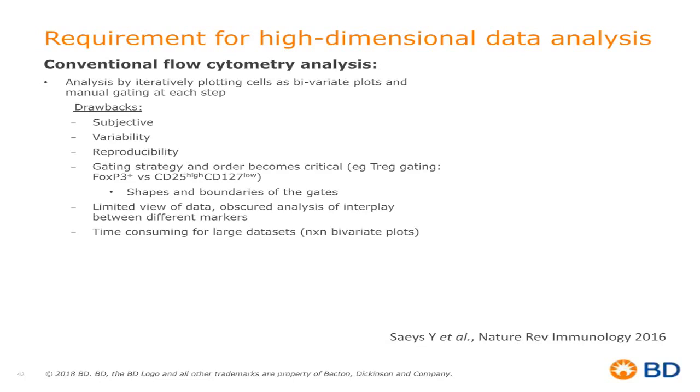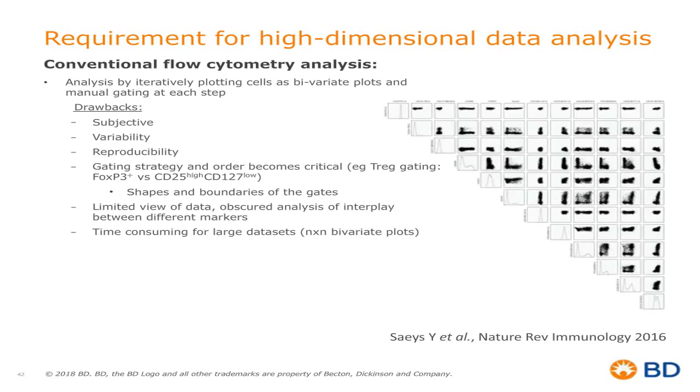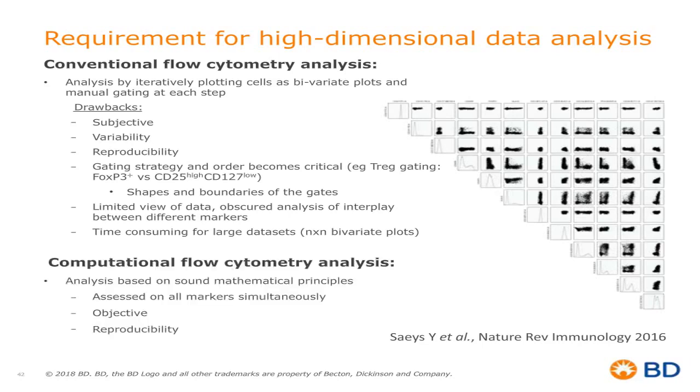You also have a limited view of the data. You have an obscured analysis of how the different markers play together. And when you get very large data sets, it can be actually quite time-consuming, as you'll have numerous n by n bivariate plots. And this grows as your panels get larger.